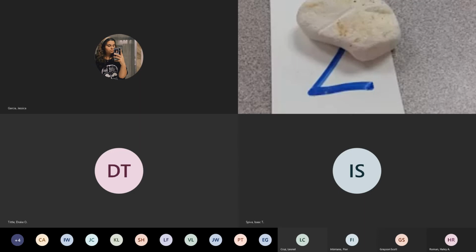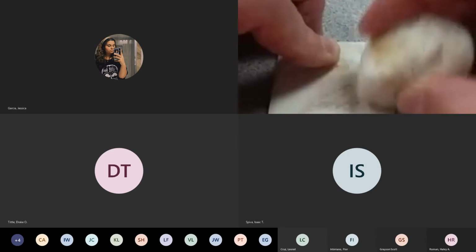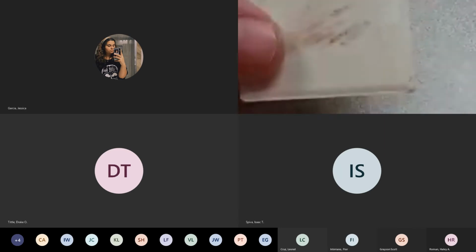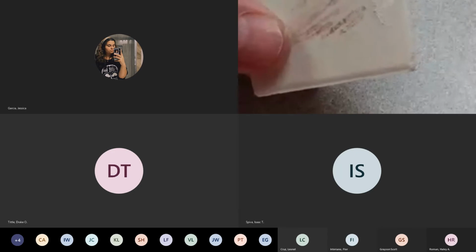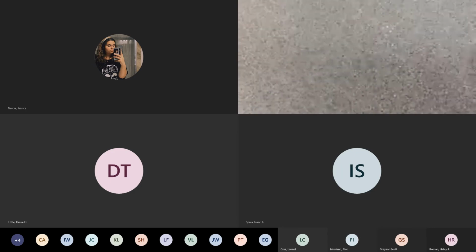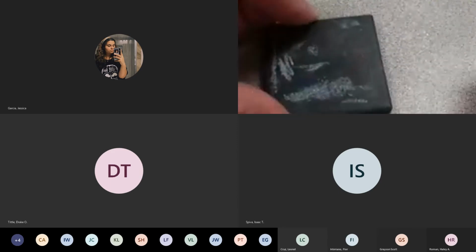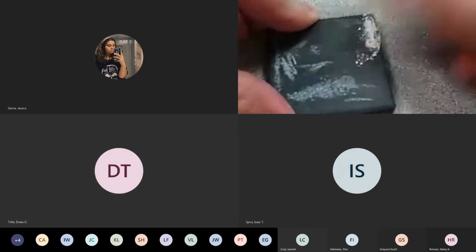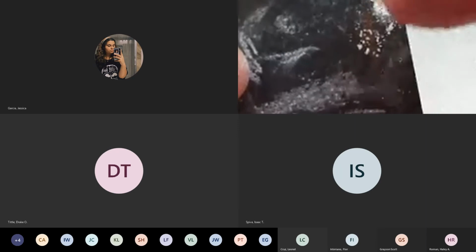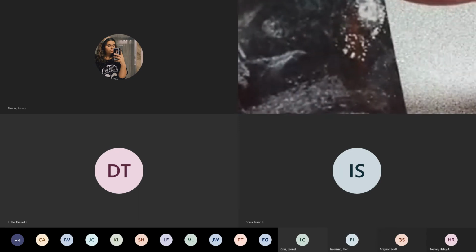Okay, what's our next test? Streak. So on the streak plate here, let's see if we can see that up close. I want you to describe the color of that streak right there. Maybe it will help if I use another streak plate. So that is the streak right. Oh, come on, finger. Get a clue. That's the streak right there.